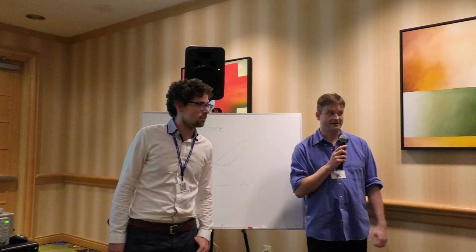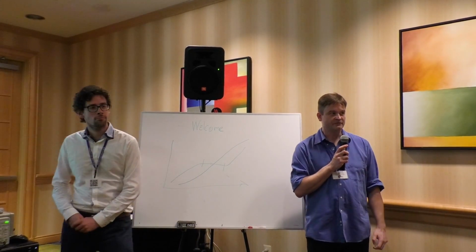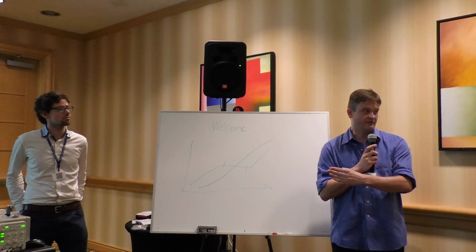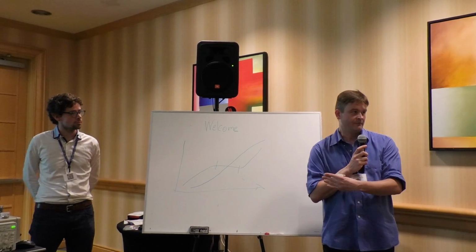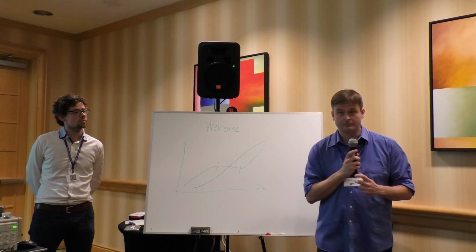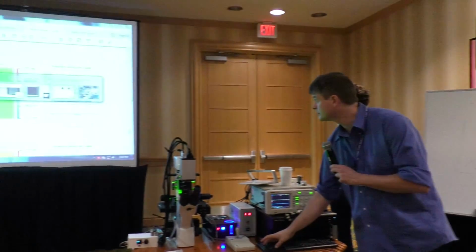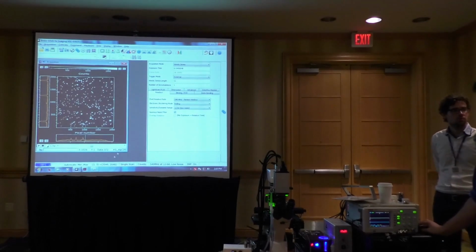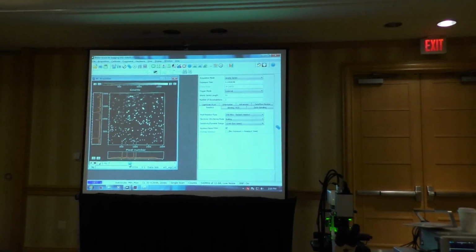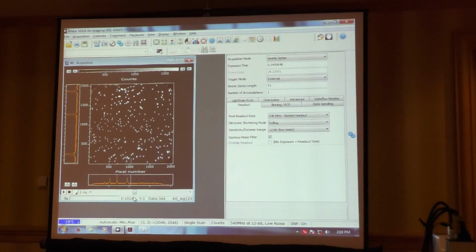But it leads us directly to the next part, right? How will this be implemented? So DCIC says what they would like to see is that they get this PSFJ run on their side, and they don't want the report from you, they want the data set. Now the data set that we just recorded, this data set does contain PSFs, right? All nicely in there. You can just extract them from the data set.